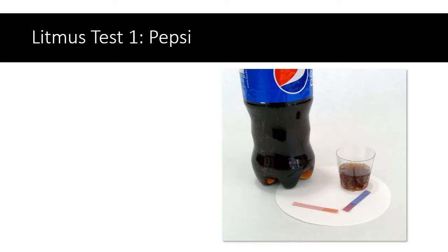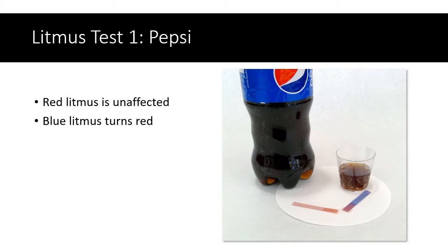The first substance we'll test is Pepsi Cola. I've taken one strip of red litmus and one strip of blue litmus and dipped them into the Pepsi. If you look carefully, you can see the end of the red litmus that was dipped in the Pepsi is still red, but the end of the blue litmus has turned from blue to red. In other words, Pepsi is a substance that turns litmus red — red litmus stays red, blue litmus turns red.